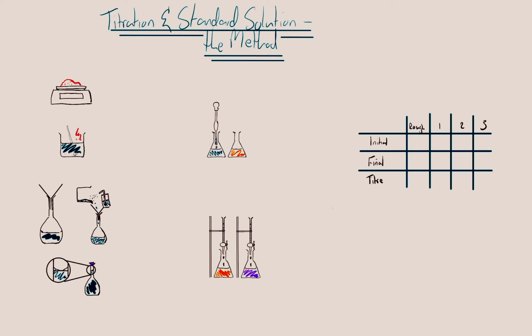What's up, guys? Thought I'd do this video in two parts because it's so important that we know these in lots of detail. So we're looking at our first practical here. We're looking at titration and standard solution. So we'll do the first video looking at the creation of the standard solution. Then we'll look at the method behind titration, including the sort of table that we draw. And then we'll start looking at the calculations for titration. So sort of three parts.